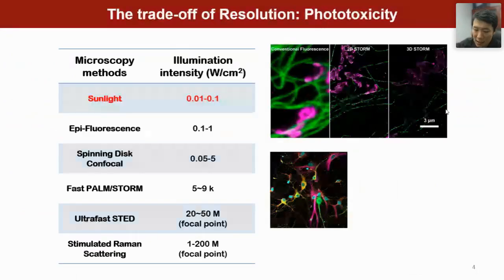I'm fortunate that in 2018, I started my own lab at Peking University. At that time, I was actively looking for new projects, and one issue came to my mind: phototoxicity. Why am I interested in this issue? Because people have been developing photostable dyes, to make sure the dye does not bleach itself. But another issue often overshadowed by photobleaching is phototoxicity. That's a concern about whether the cell or any creature would be healthy enough under light to withstand the strong light.